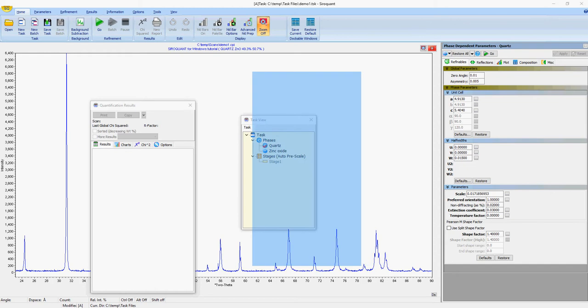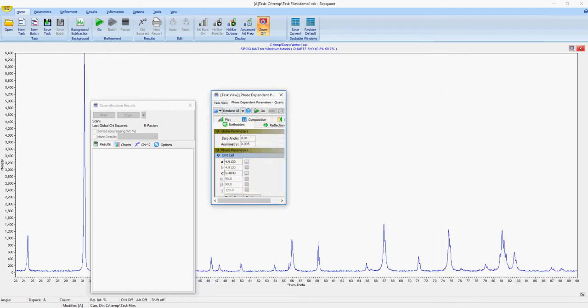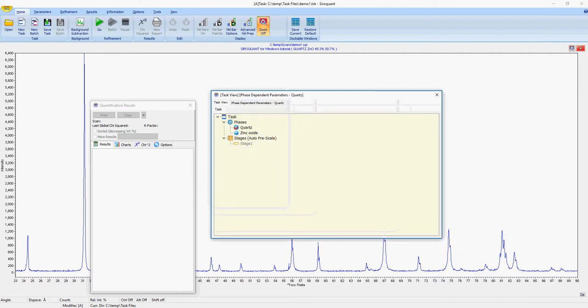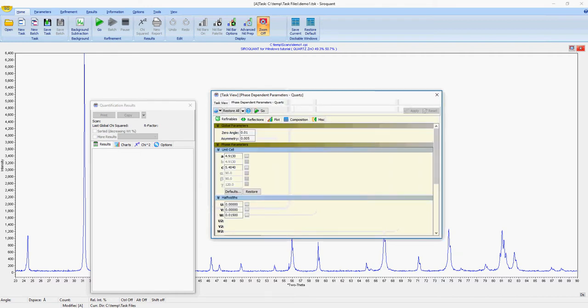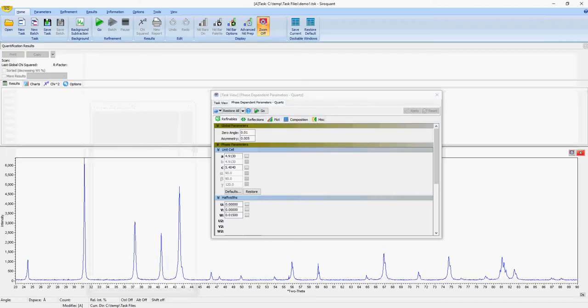You can undock them, dock them within each other. You can see here. You can resize them. You can also dock them in different positions within the application itself.